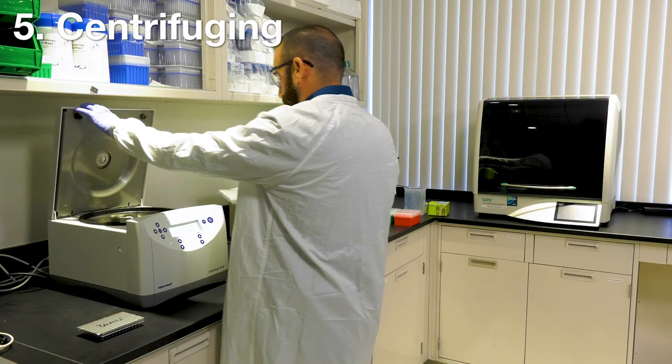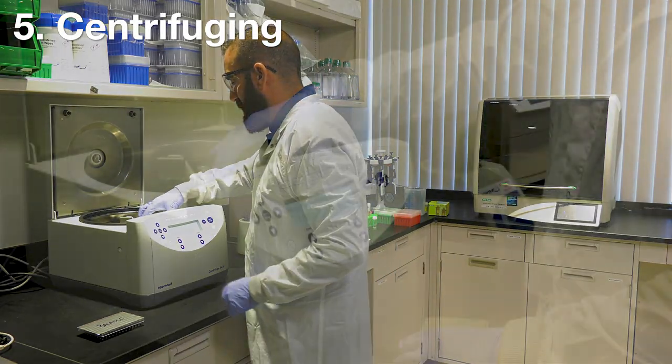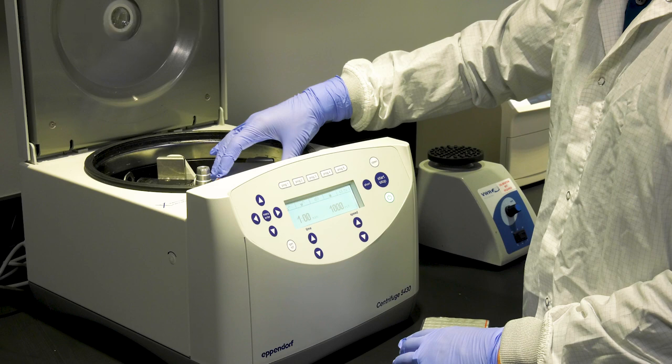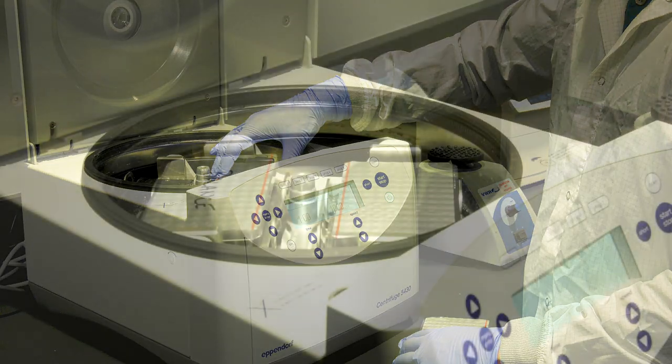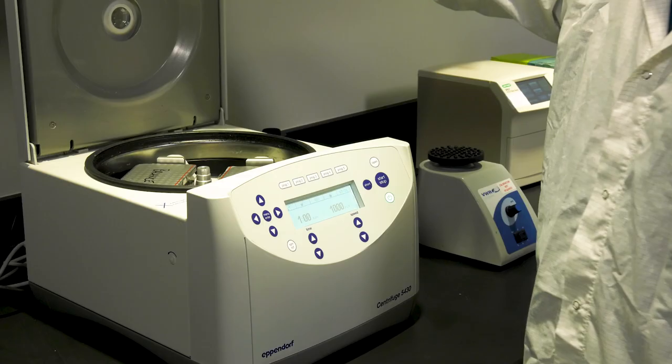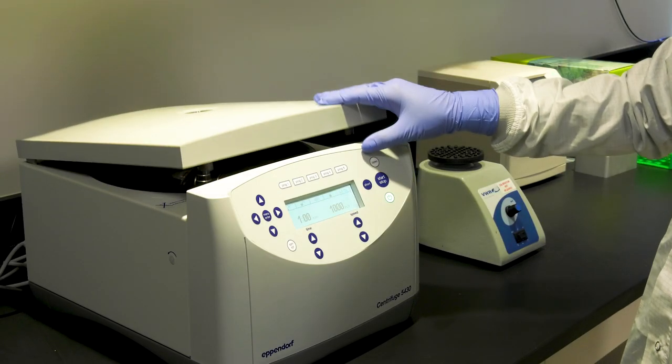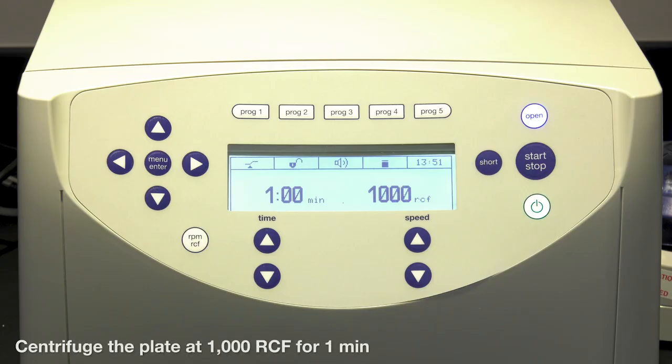Next, place the plate in a centrifuge to make sure the 1X reaction mixes are all at the bottom of the wells for the automated droplet generator to properly pipette them. Add a balance plate and begin centrifugation. We recommend 1000 RCF for one minute.